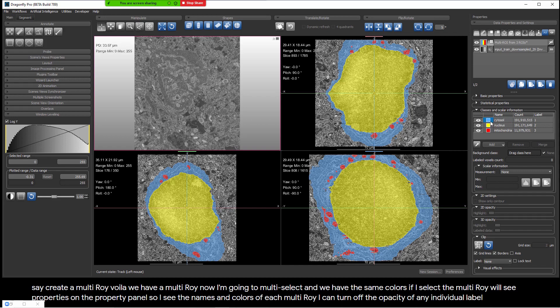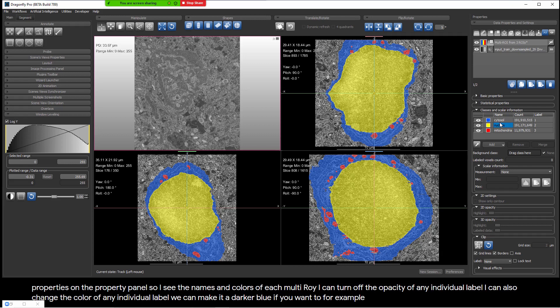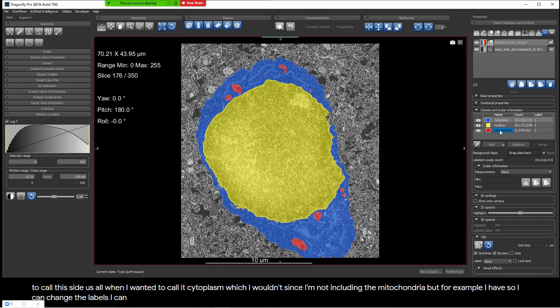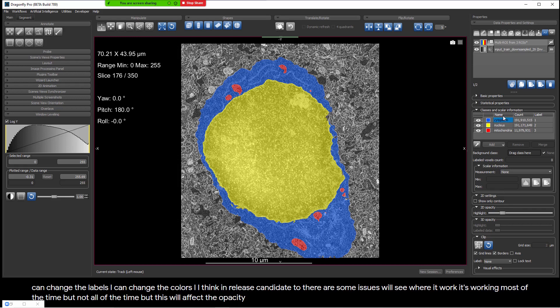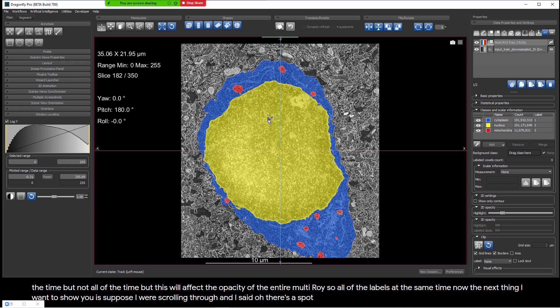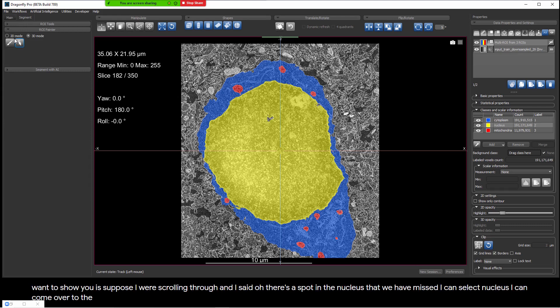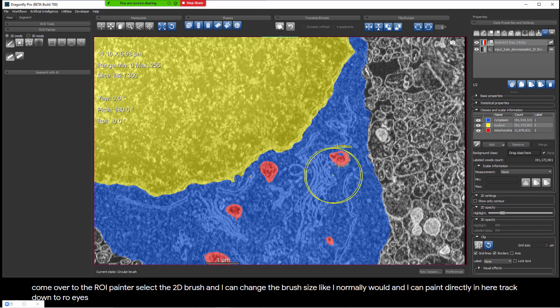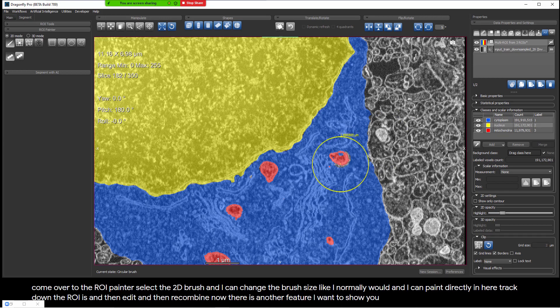I can turn off the opacity of any individual label. I can also change the color of any individual label — make it a darker blue, for example — and I can change the label name. So if I didn't want to call this cytosol and wanted to call it cytoplasm, I can. I also have a 2D opacity in Release Candidate 2, though there are some intermittent issues. Now, suppose I'm scrolling through and I see a spot in the nucleus that was missed. I can select nucleus, come over to the ROI Painter, select a 2D brush, change the brush size, and paint directly on the MultiROI. This is an immediate advantage — I don't have to extract ROIs, edit them, and then recombine.